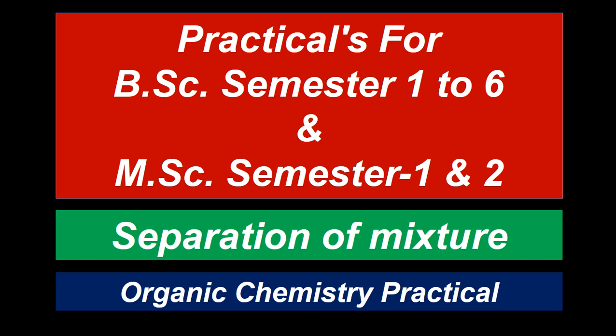Hello friends, today's topic is Organic Chemistry Practical for B.Sc semester 1 to 6 and M.Sc semester 1 and 2. So today's topic is for both B.Sc and M.Sc, and I am Dr. S.D. Sutaria. Okay, so we are talking today about separation of the mixture.